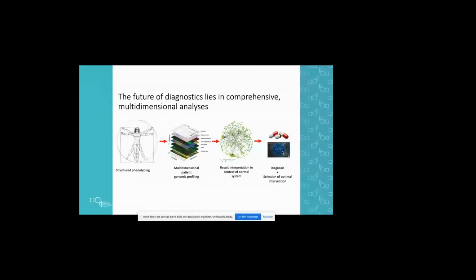Here, I would like to illustrate this complexity with a recent example taken from the coronavirus epidemic. Indeed, we all agree that NGS was a powerful tool to decipher the genomes of the viruses very quickly, and this was helpful for setting up the detection kits used in diagnosis and to control, of course, the propagation of the disease.